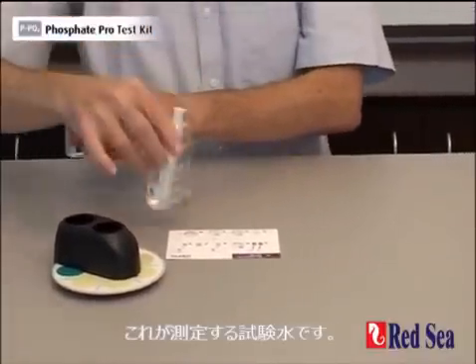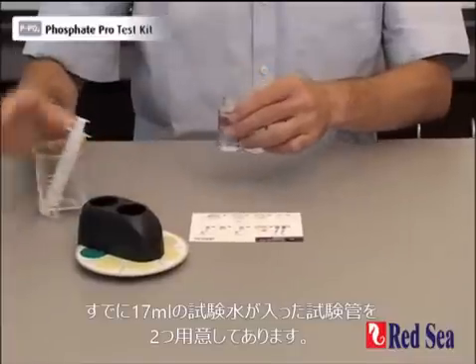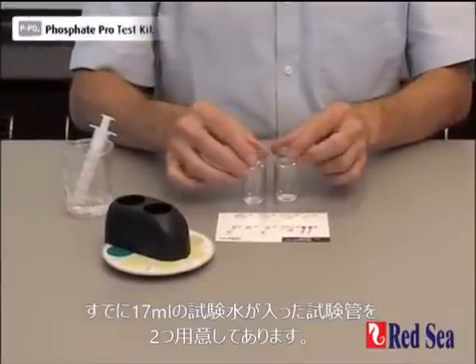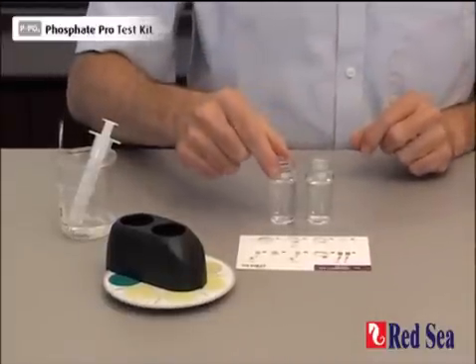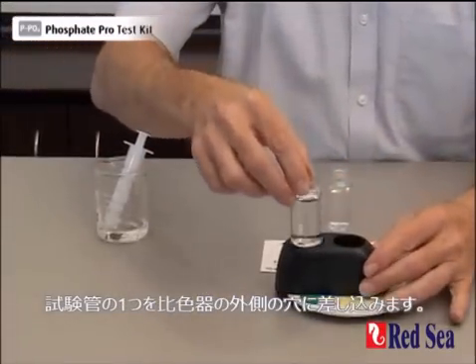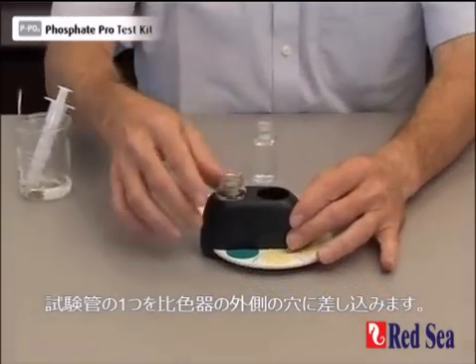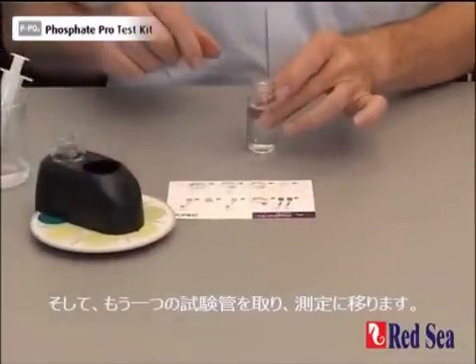This is the water sample that we need to test. I've already prepared two vials with 17 ml of water in them to do the test. One of the vials we place on the outside hole of the comparator. Now we're going to do the reaction in the other vial.